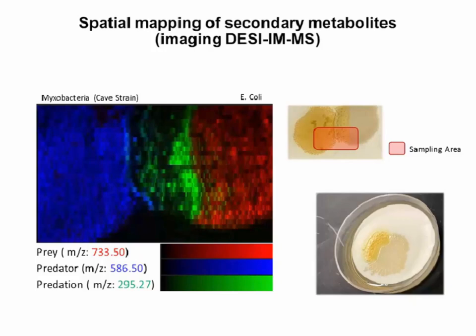We have also started annotating and tracking natural products involved in signaling within the environment of the microbes by sampling the areas outside of the cell colonies, but still directly on the membrane. So this is one of our first images with the desired spatial prioritization representing prey, predator, and predation. The three features are represented by the unique colors of these different regions of interest. It's important to highlight that our analyses do not encompass just three regions and three features, but rather these are representative of many regions made up of thousands of features.